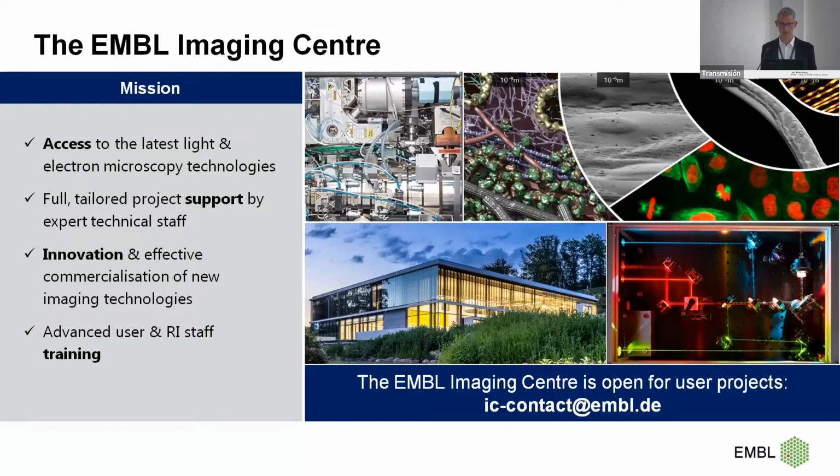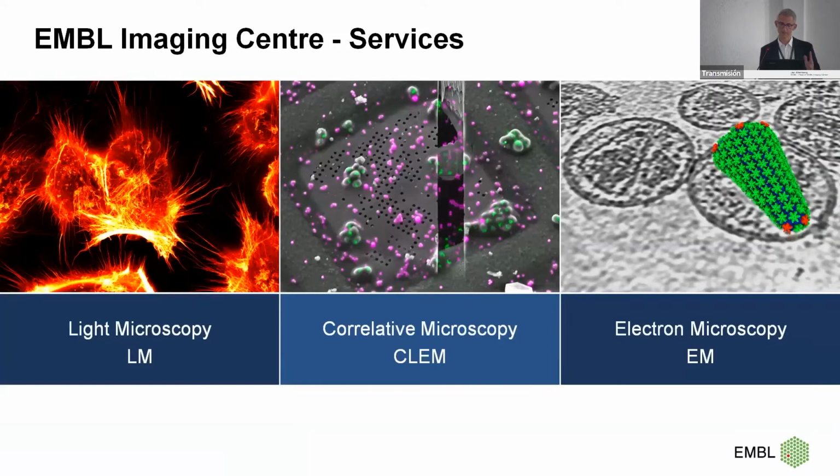And of course, training is always an important aspect of providing access to such technologies. So that means we want to marry light microscopy and also other intravital imaging methods with the latest developments in electron microscopy. And actually, as I will say at the end of the lecture, also with X-ray imaging technologies. And in between is a whole family of correlative methods. So you can bring the same specimen from an intravital experiment all the way down to a structure experiment and really get, in the same project, an understanding about function and structure at the same time.